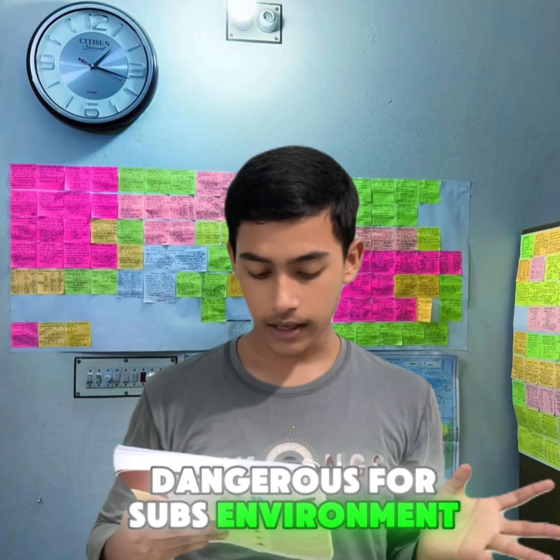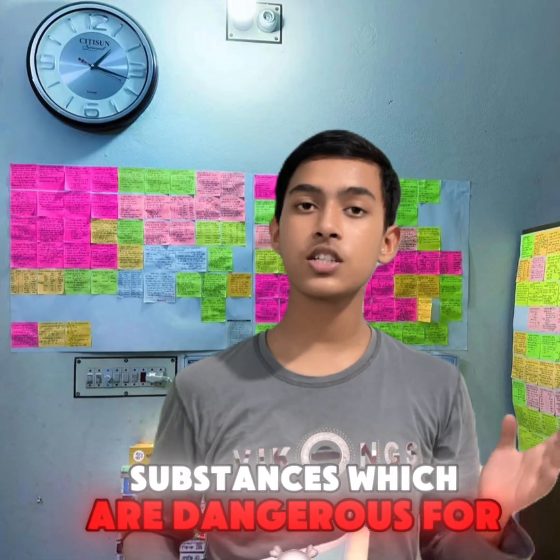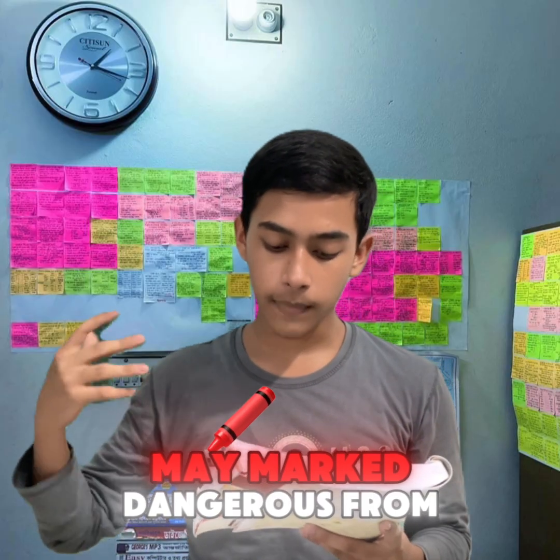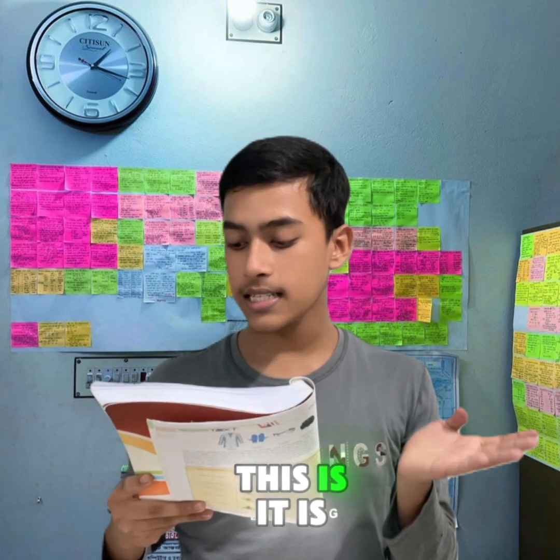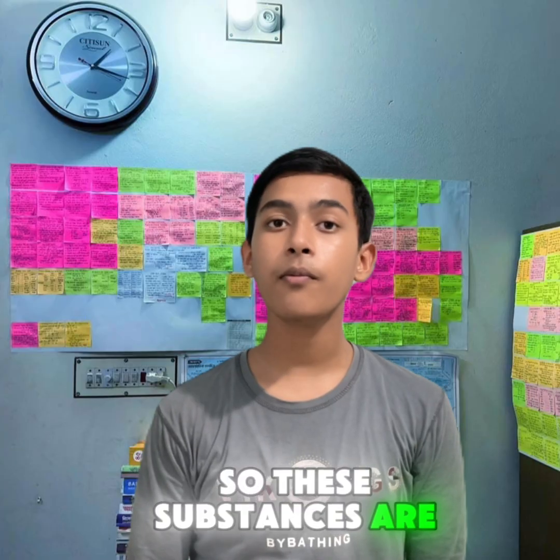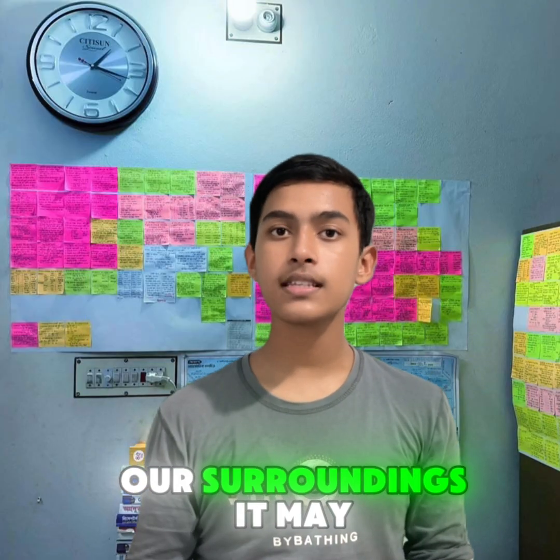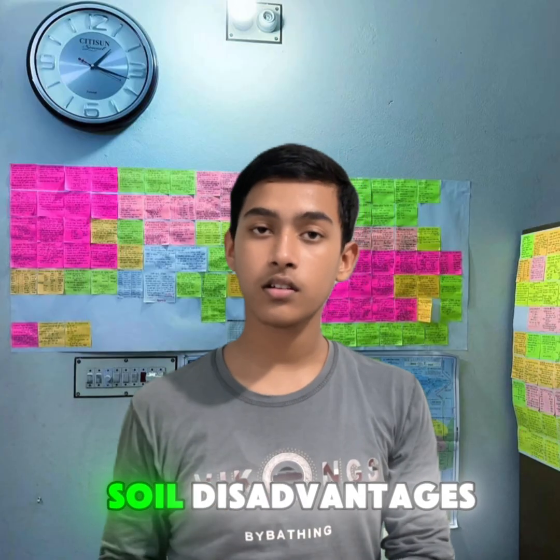Next is dangerous for the environment. There are some substances which are dangerous for our environment, so they are marked as harmful to the environment. They are dangerous for both plants and animals. They may harm our trees, our surroundings, and cause many types of soil problems.